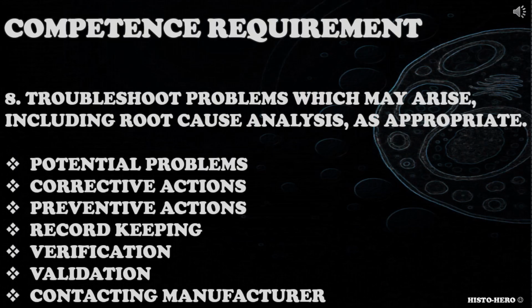The eighth competence requirement is troubleshoot problems which may arise, including root cause analysis, as appropriate. Candidate should be able to troubleshoot problems, including root cause analysis. Does the candidate know how to troubleshoot problems associated with microtomy? Are they aware of the common problems associated with microtomy? Can the candidate perform root cause analysis? Does the candidate keep proper record trail and documentation? Does the candidate know how to contact the manufacturer, if needed?